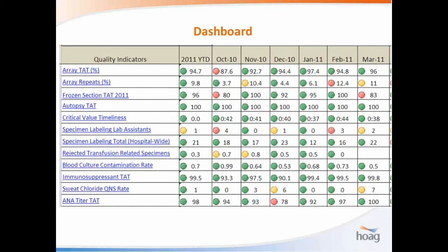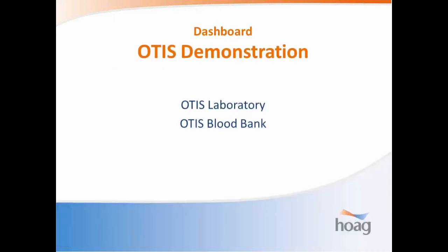This is sort of the quintessential quality corner, quality improvement dashboard. This is an example from not my facility, from another facility, which I'd love to get to someday, but this is sort of a green, red, yellow light. How well are you meeting your quality indicators? And if you click on this link, it takes you to another spreadsheet where it has the detailed data. So we'd love to get to this someday, but it's just an example of a really neat KIQ dashboard.